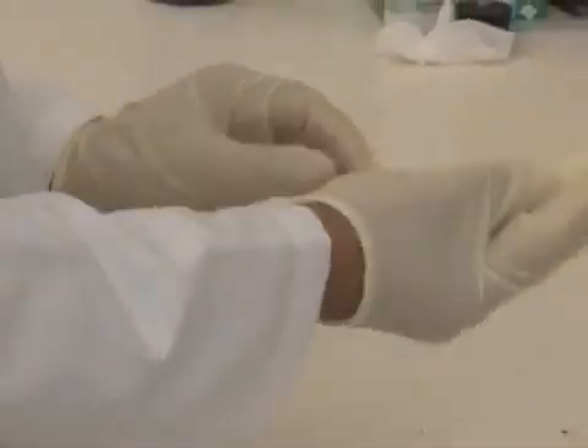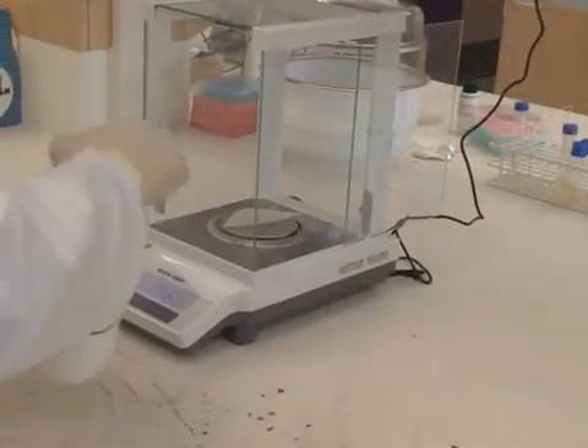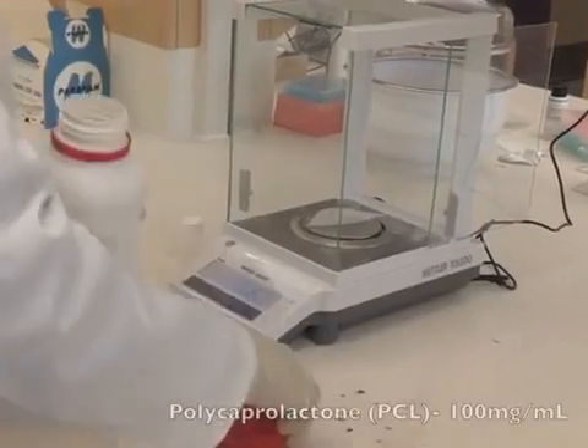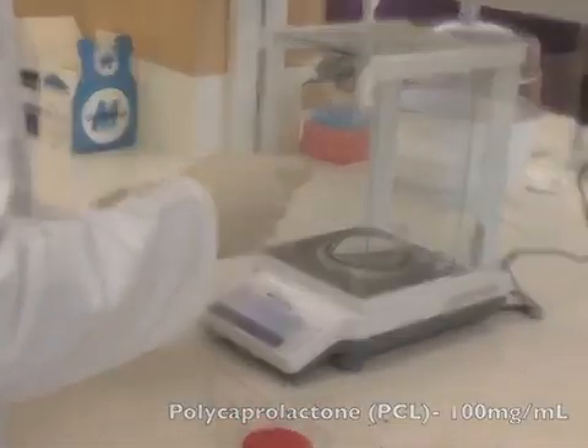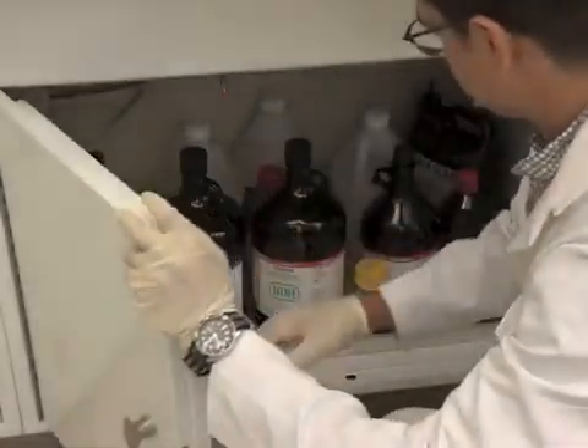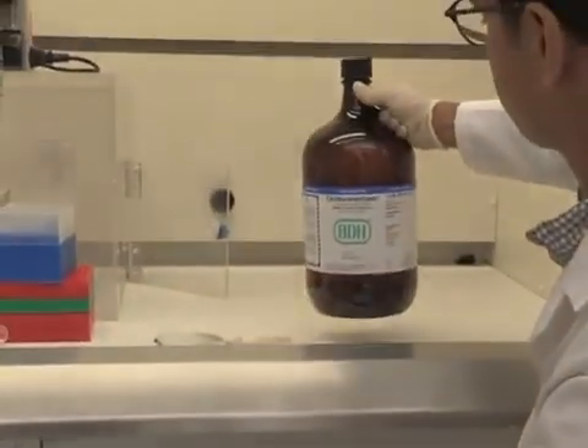Firstly, ensure proper safety equipment is worn when dealing with potentially hazardous chemicals. The primary step in this procedure is to prepare a solution of polycaprolactone, or PCL, at an approximate concentration of 100 milligrams per milliliter. Dissolve the polycaprolactone in a mixture of dichloromethane and dimethylformamide at a ratio of 4 to 1.